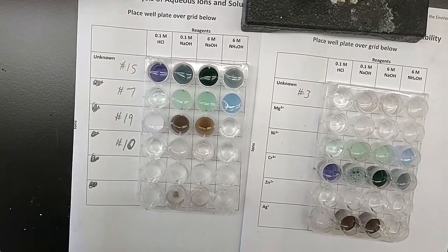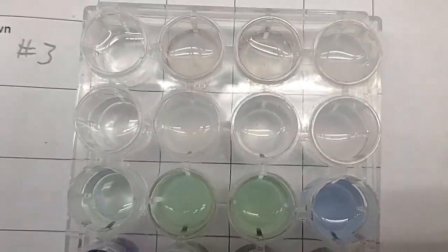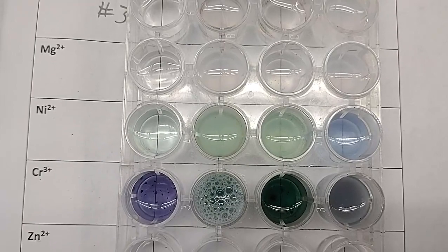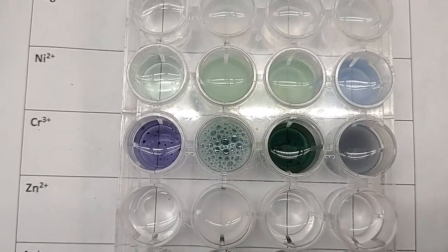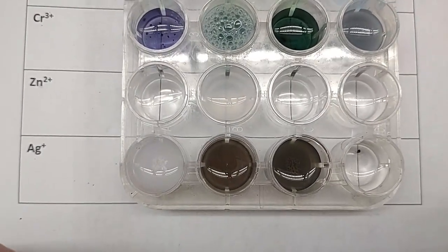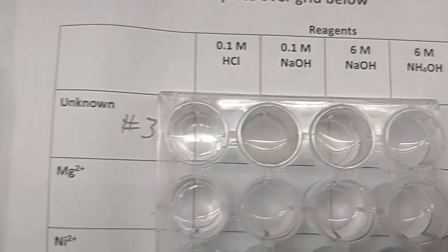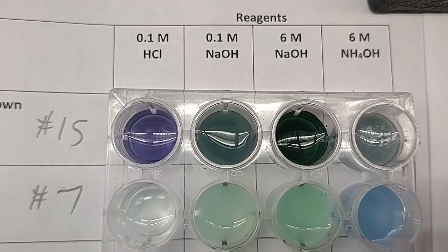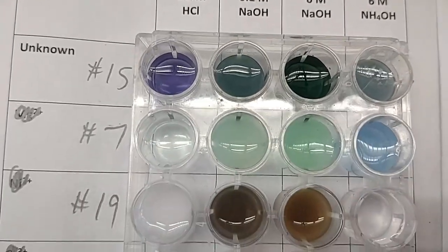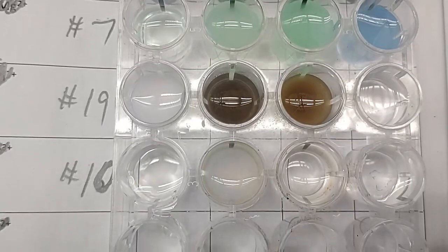Do a close-up of each one. Magnesium, nickel, chromium, zinc, silver. Unknown number 3. Unknown number 15. Move it over so it's on the line so you can see a little better. Unknown number 7. Unknown number 19. Unknown number 10.